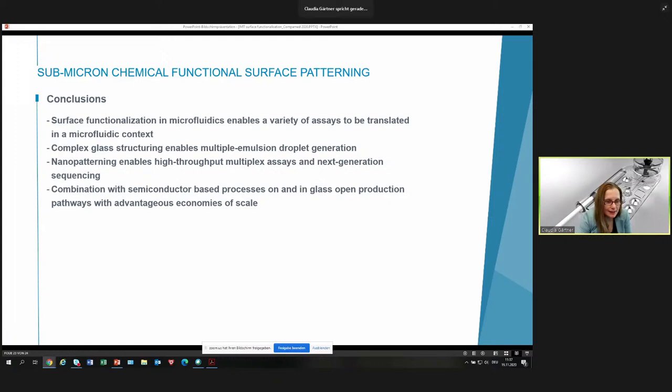You were discussing not only glass fabrication, but also integration of reagents, making a real lab on a chip device or micro total analysis system happen. The interesting question when we go from the R&D to the real world is about cost. If you have an array integrated in your glass slide, taking the format of a microscopy slide, which cost categories can you achieve? So if we are talking about, now if we think about the NGS flow cell, right?